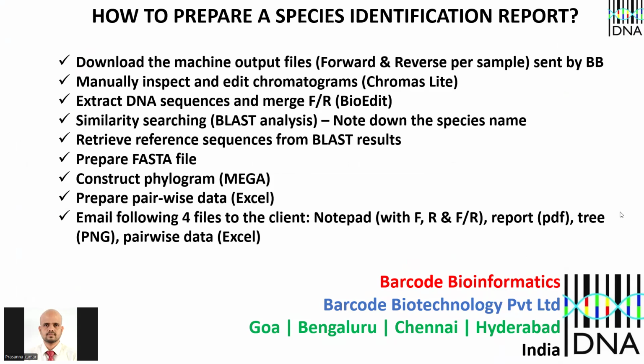Thank you for joining. And like I said, today we will be seeing how to prepare a species identification report. Okay, as a Barcode Bioinformatics division, this is an important department that connects the wet lab with the clients. Okay, so it is here in the Bioinformatics division that the species identification report and gene identification reports are prepared.